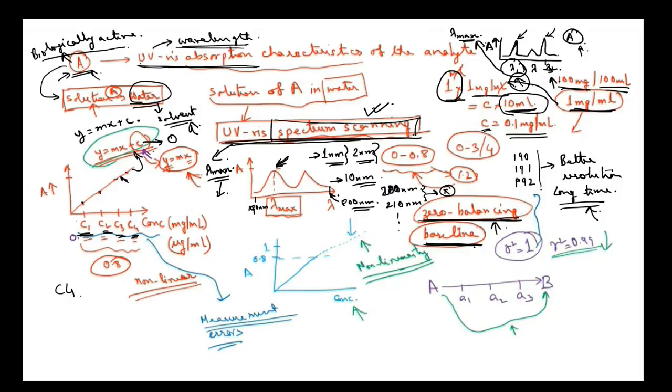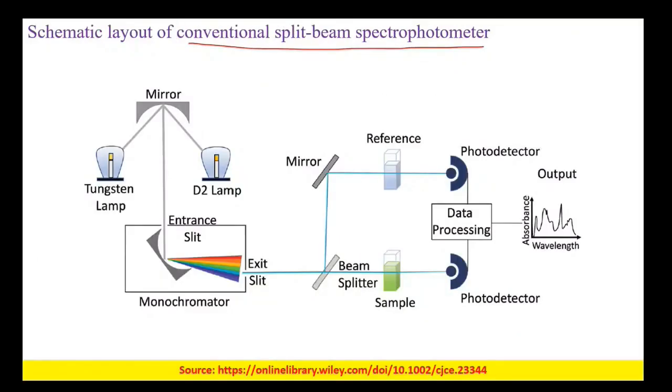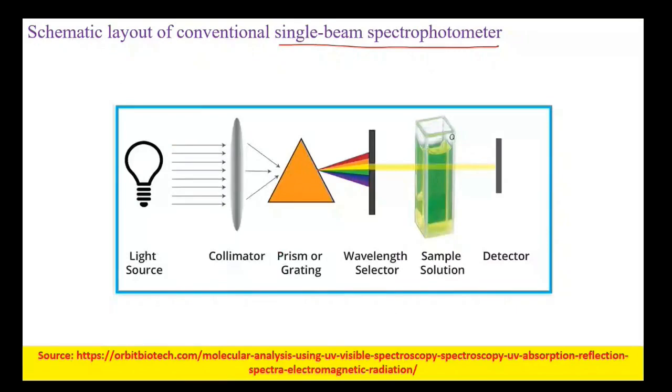Okay, so for that, I will go back to our initial single beam spectrophotometer first, and consequently the other spectrophotometers. In this case, if you see, there is only one slot. So in a single beam spectrophotometer, there is only one place for putting the sample, right? Now, since there is only one place, what to do in this case?